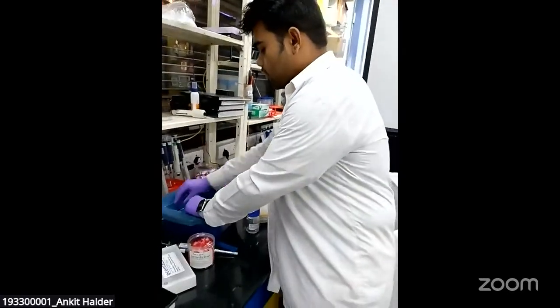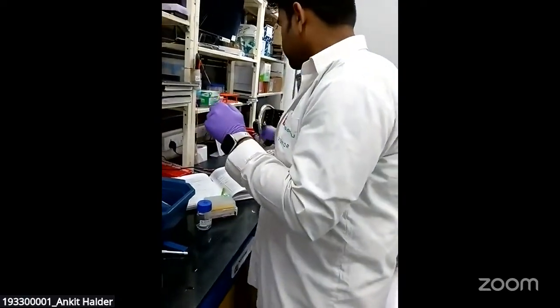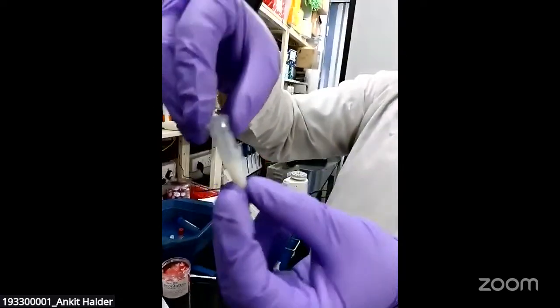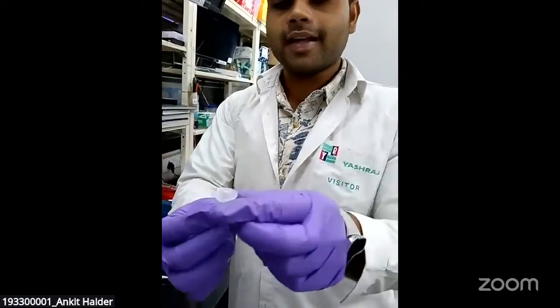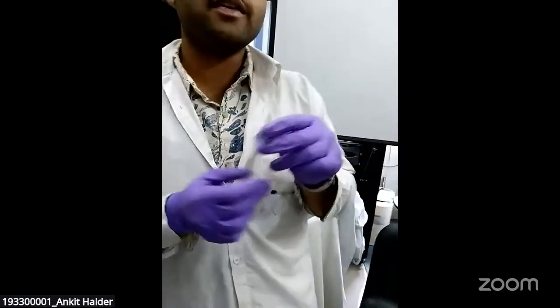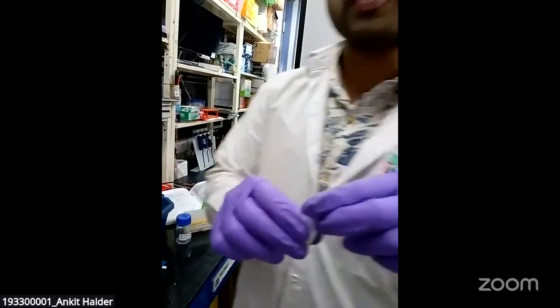After the overnight incubation, you will see this kind of whitish layer. This is the serum and methanol kept for 8 hours at minus 80 degrees Celsius, and after that we centrifuge it again at 14,000 g, 4 degrees Celsius. After that we get a supernatant, and that supernatant we need to dry in the speed vac.